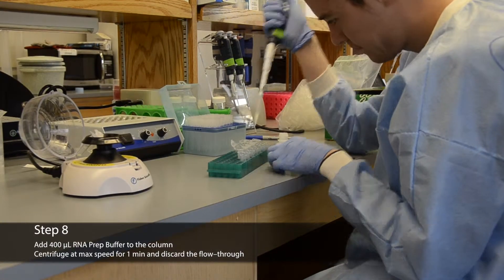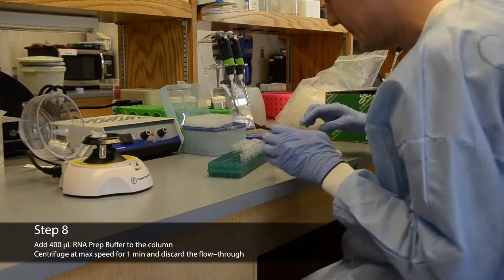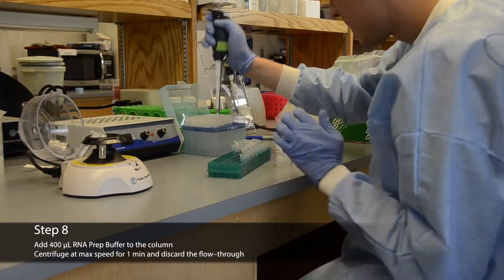Add 400 microliters RNA prep buffer to the column and centrifuge at max speed. Once again, discard the flow through.